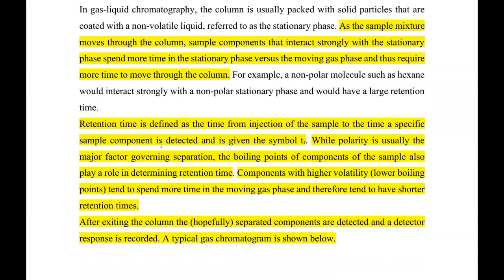Now, there's what we call the retention factor. We don't use much of it here, but we use it in thin layer chromatography as well as paper chromatography. Allow me to talk about the retention factor.